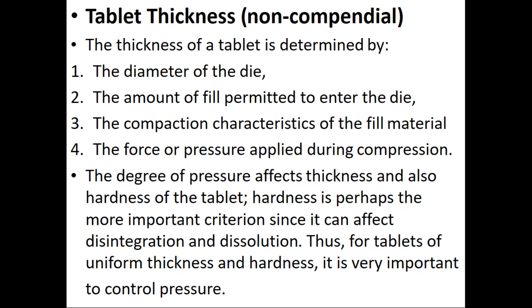The degree of pressure affects thickness and also hardness of tablet, and hardness is perhaps more important than the thickness. Why? Because it can affect disintegration and dissolution. Thus, for tablets of uniform thickness and hardness, it is very important to control pressure.